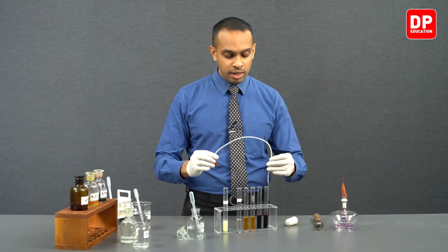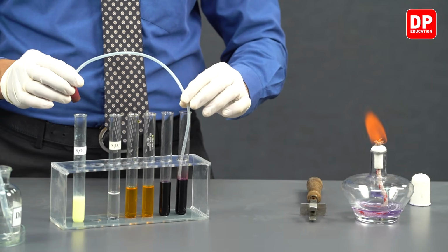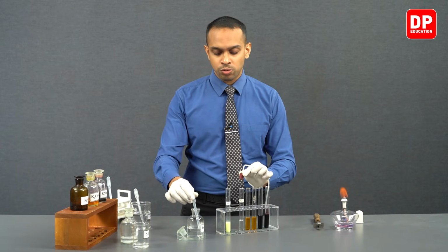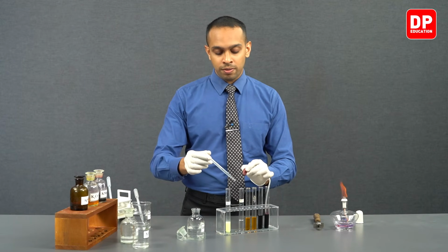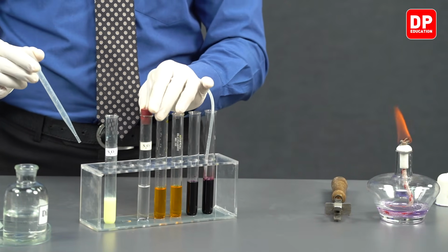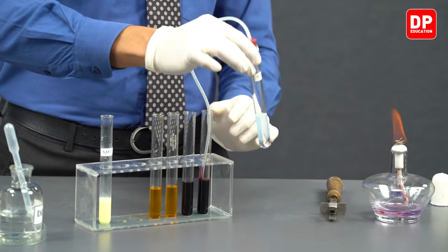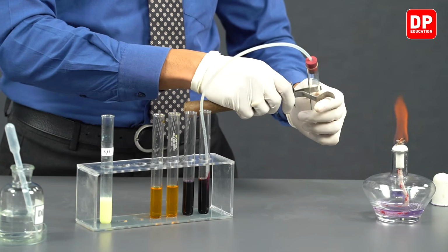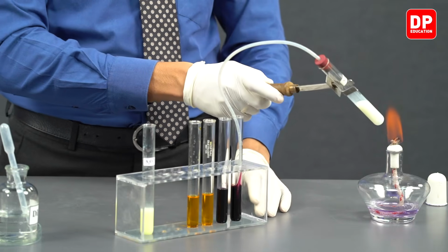We will insert one end of the delivery tube into the acidified potassium permanganate solution, and we'll place the rubber stopper on the test tube as soon as we add the HCl onto our thiosulfate solution. To speed this reaction up, we can heat this mixture.